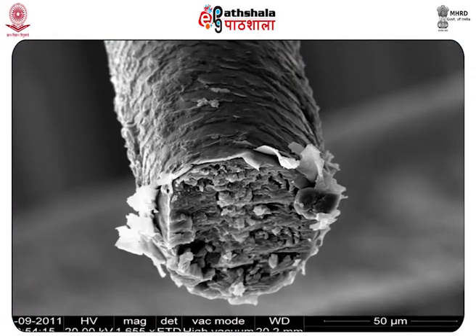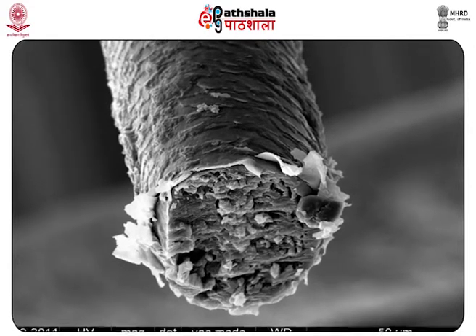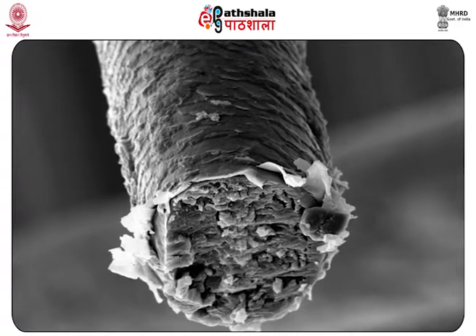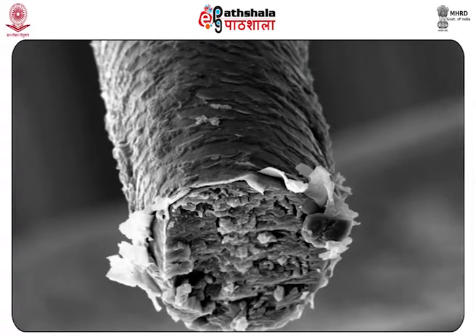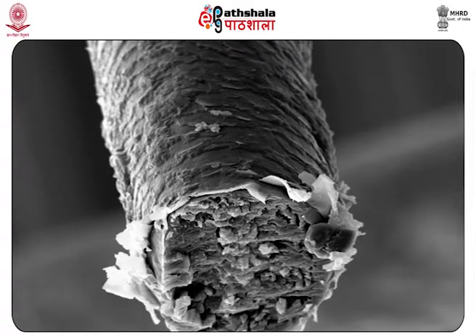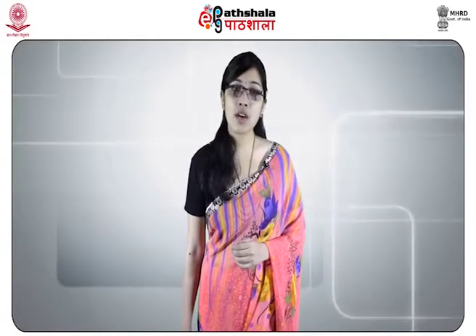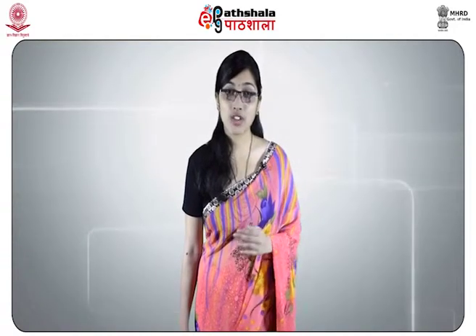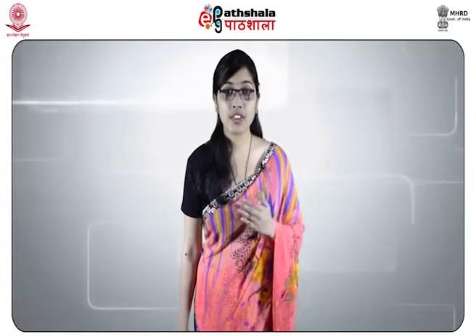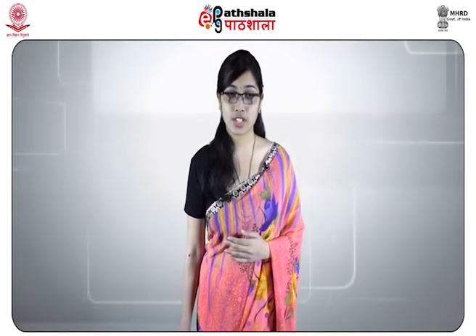The detailed microscopic examination of hairs is done after cleaning them in an alcohol-ether mixture or acetone. They are then mounted in Canada balsam on a microscope slide and examined with a magnification of about 400x. The examination reveals the actual color of the hairs. The contamination, which may be masking the real color of the hair, is removed in the cleaning process.